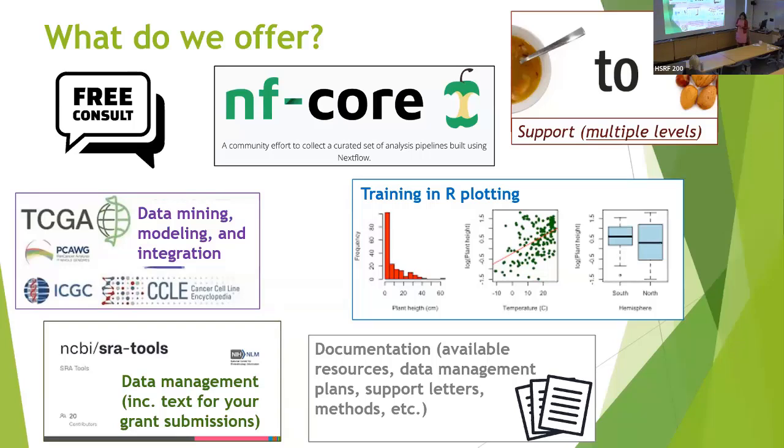So it's kind of an issue in our community, and this is an effort to get everybody on the same page. And the benefit of these nf-core pipelines is there are pre-written modules now, and they're actually pretty user-friendly to interact with, so we can help you or your students figure out how to run your data, like your genomics data, through one of these pipelines yourself.